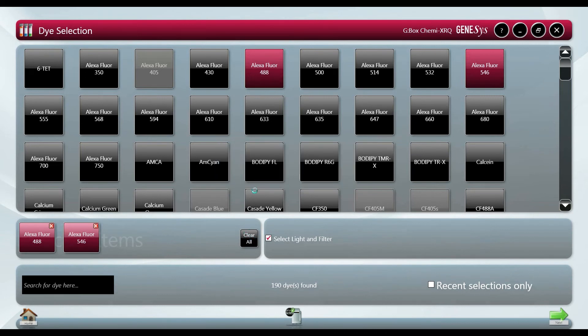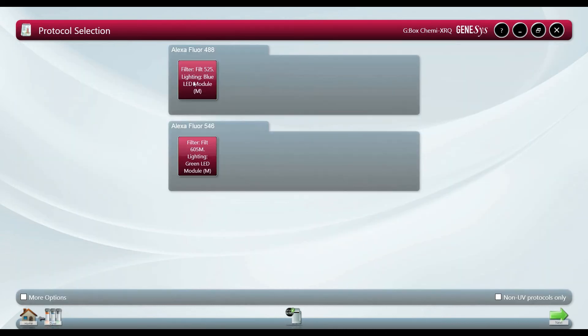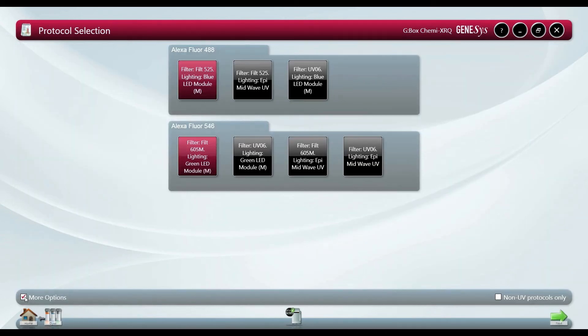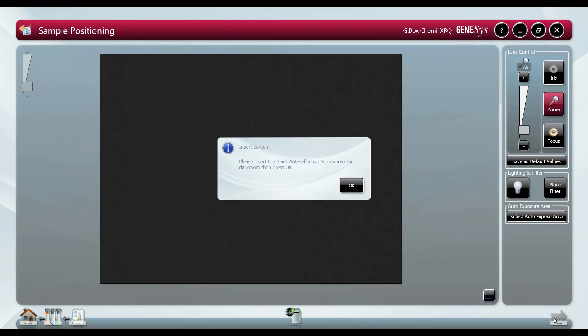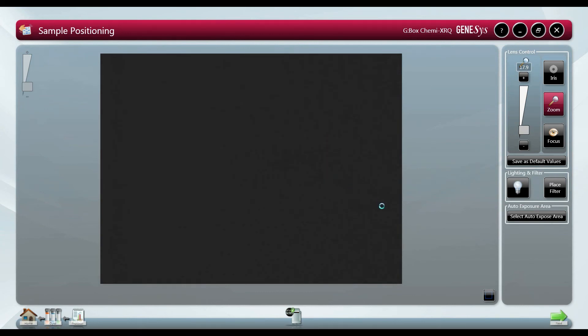In the image preview tab we can make sure the sample is positioned correctly and is in focus by using the automated lens controls. If you are unable to see your blot clearly you can place a piece of paper with writing on it in the darkroom to adjust focus.